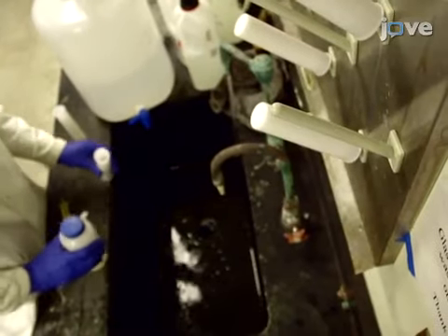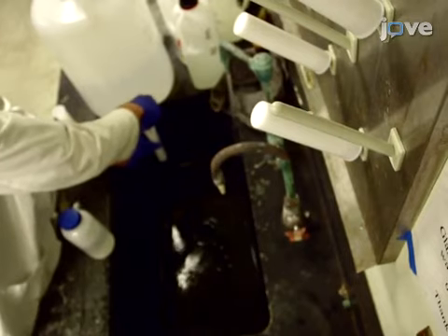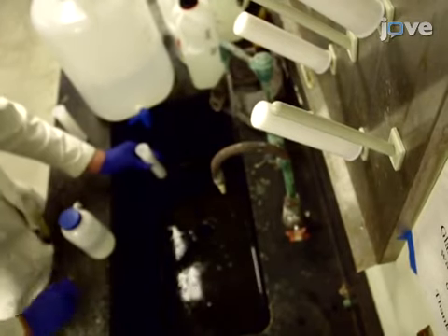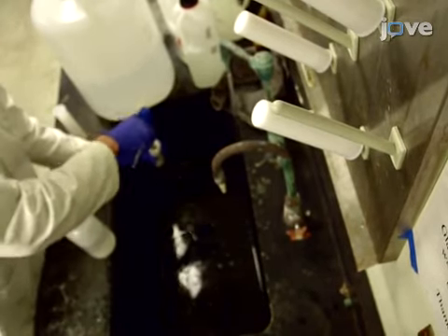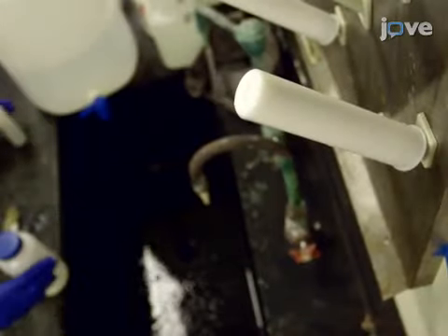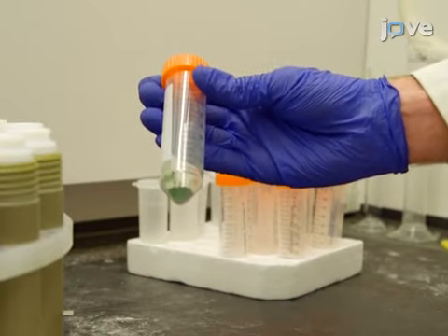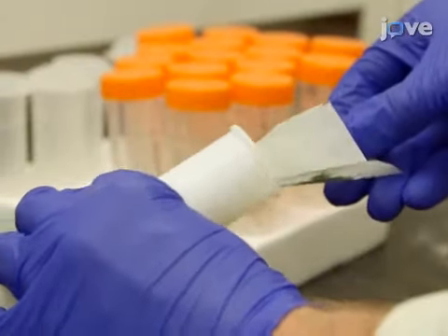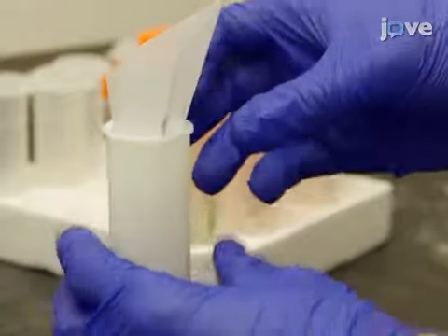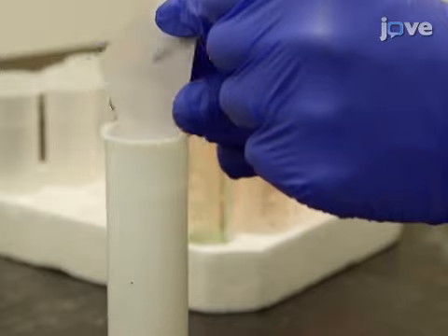To prepare samples for inductively coupled plasma mass spectrometry, or ICP-MS, begin by using soap and water to wash Teflon microwave digestion vessels and let them air dry. After removing trace metals according to the text protocol, to digest the biomass, add 50 milligrams of freeze-dried biomass to the microwave digestion vessels.